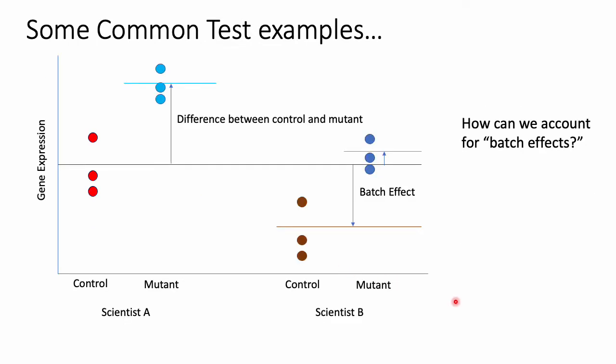Finally, even within pairwise comparisons, non-biological factors, such as if two different scientists produce the datasets, can produce unintended batch effects. We will learn how to account for these batch effects to improve the fidelity of our analysis.